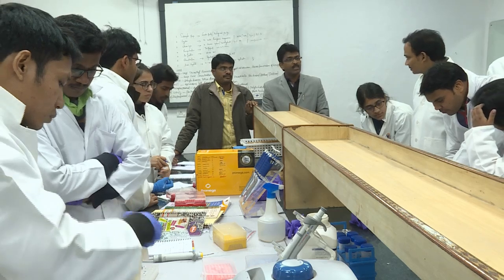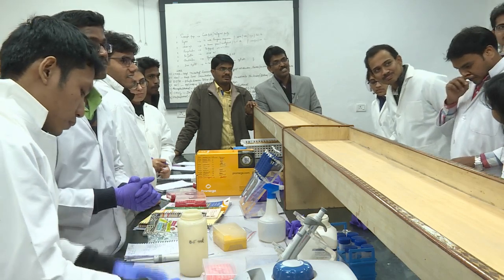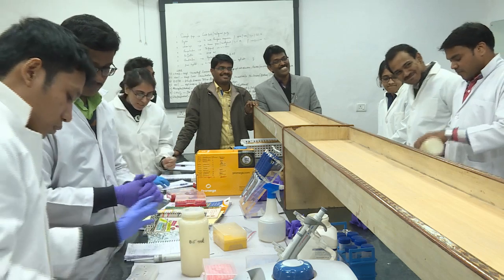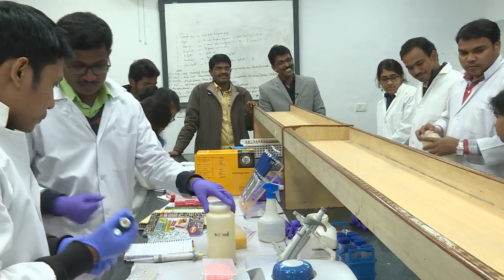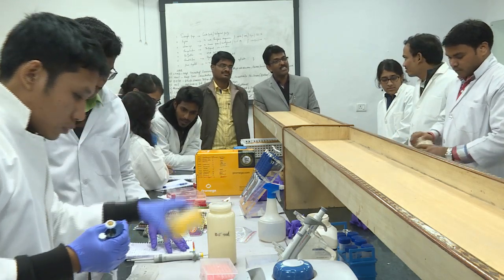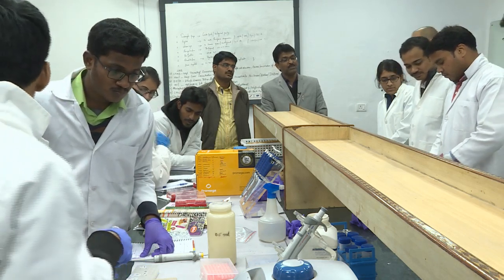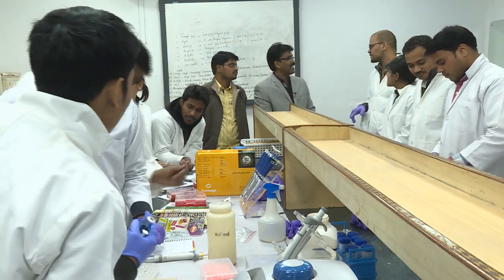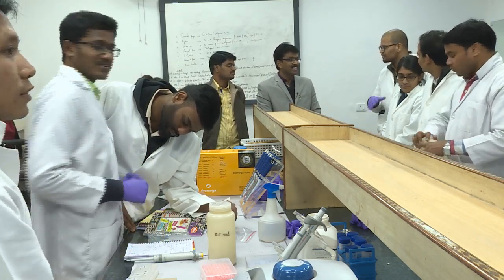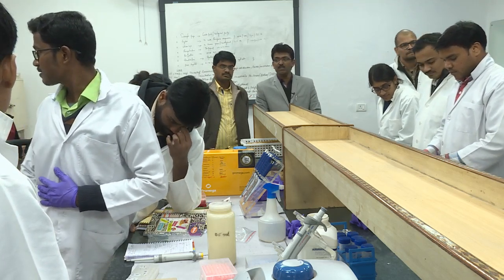So now one group is left out now. They are still struggling, it seems. I do not know what this group is really isolating. So that sample, what is that sample? Sclerotium. Okay. No, don't worry. You go ahead of doing PCR and see. Okay, that is ITS.